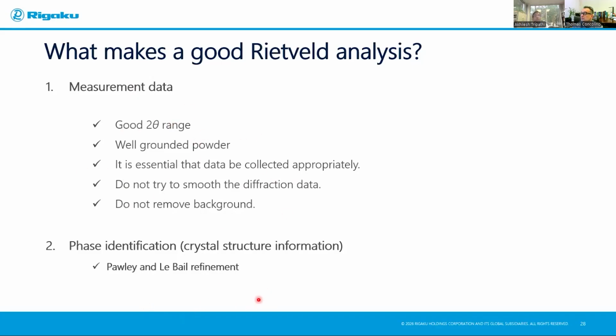The next point is, what does Rietveld refinement need from you? Phase identification. That's something you are doing and putting in, and then the program begins. And it's best if you have crystal structure information. We will emphasize why crystal structure information matters in the next few slides.